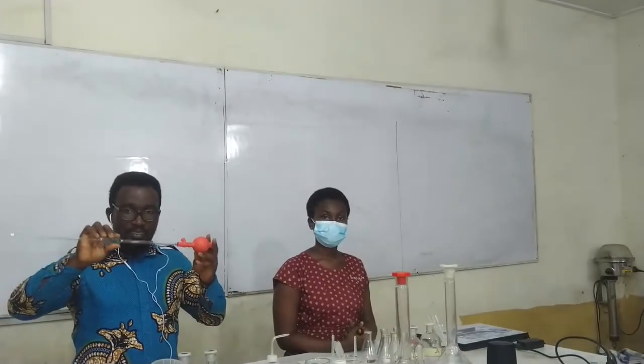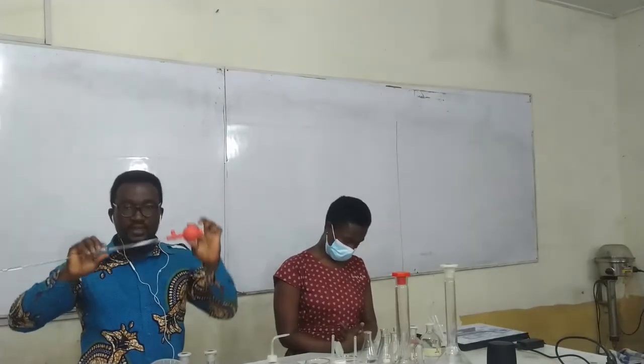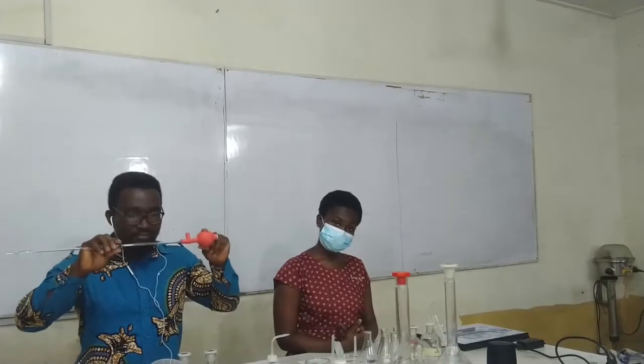We also have a pipette with a filler. So this is the pipette filler. We commonly call it the pipette filler. Let me give you some small story or history about this. The history behind this is that at first we used to put our mouth to the mouthpiece. So this is the pipette and then this is the mouthpiece. We put our mouth to the mouthpiece, then we suck the solution to measure the specific volume we want to measure, specifically 25 cm3, since this is a 25 ml pipette.